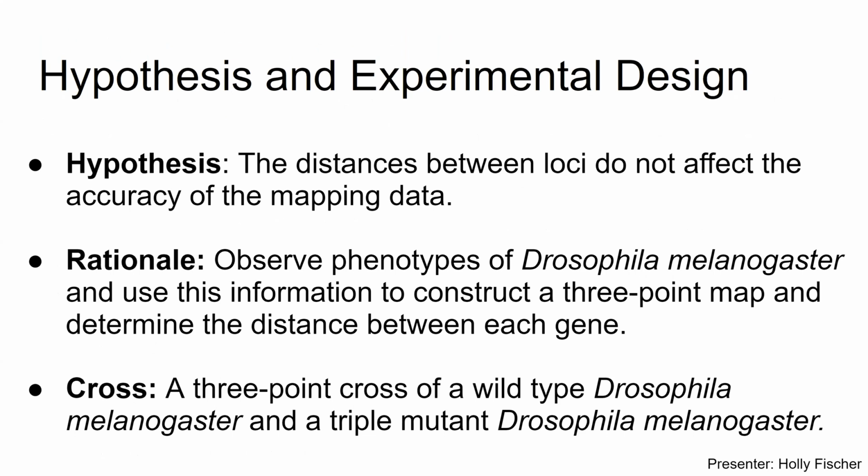Our hypothesis for this experiment was that the distances between the loci do not affect the accuracy of mapping data. To test this hypothesis, we needed to observe the phenotypes of Drosophila and construct a 3-point map.